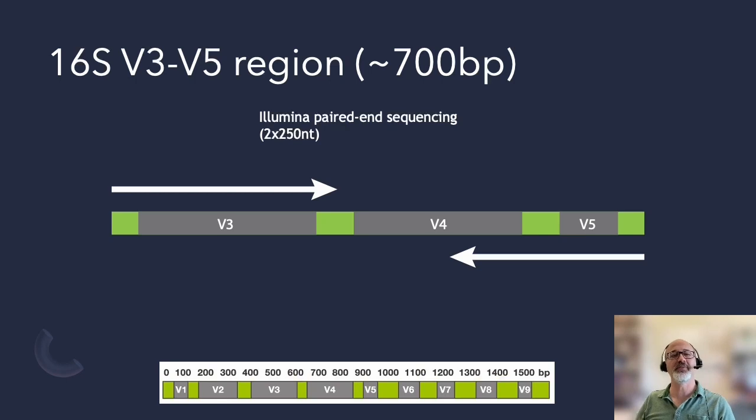And then finally, V3, V5, where the reads don't overlap at all. So we want to have reads that you can do as, again, a single end, or you may want to merge those in the middle by adding a string of Ns, uncalled nucleotides, and do the analysis as if it was one long read.